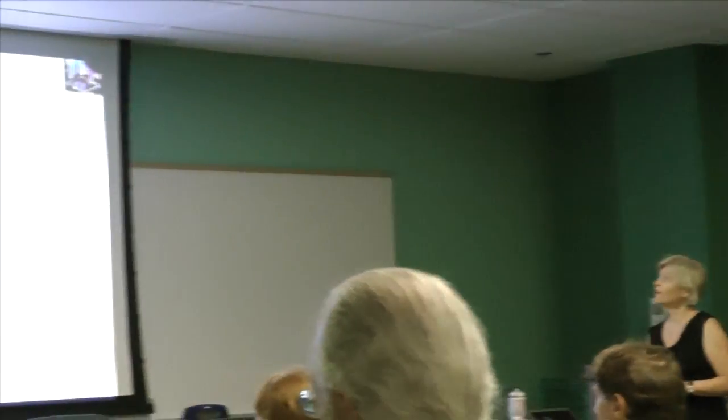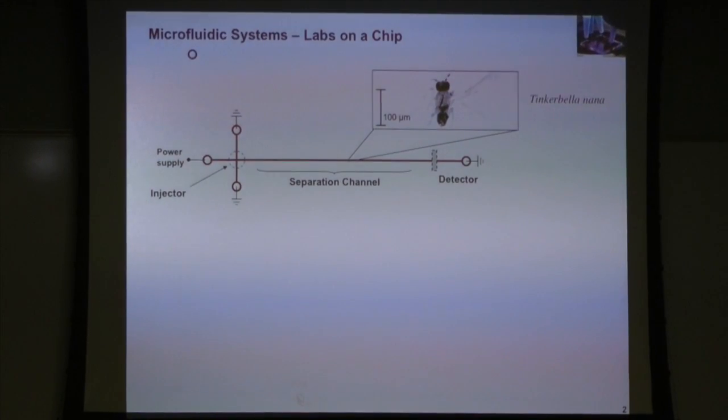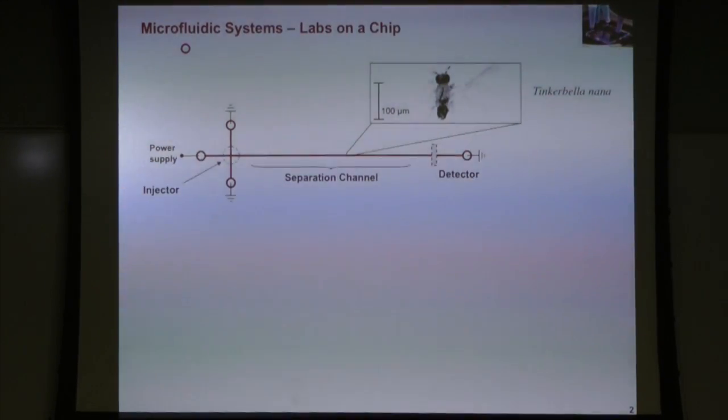So I'd like to start my talk with a short introduction on microfluidic platforms and microfluidic systems, which are also often called lab-on-a-chip systems. And I brought an example of how an analytical chemist might look at these systems. What you see here is a schematic depiction of such a realization of a microfluidic system. In red you see microfluidic channels, and the circles represent the reservoirs with which we can access these channels with fluids. Most of the time, at least in our lab, we put electrodes in these microfluidic reservoirs, and then we apply potentials, and this is how we try to manipulate biomolecules, nanoparticles, and other things in these microfluidic devices.